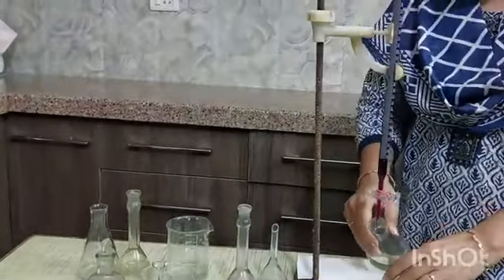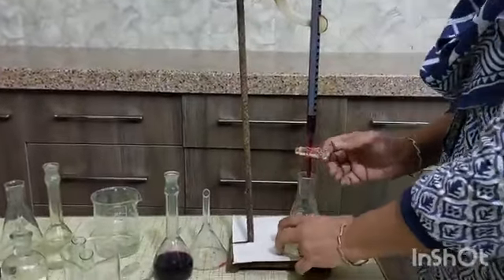And then titrate it with KMnO4 solution.